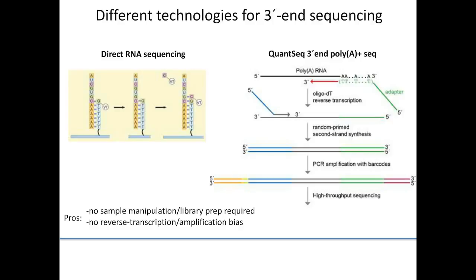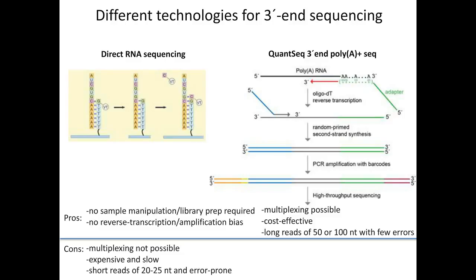If we look at the pros and cons of these, the pros of the direct RNA sequencing are that there are no sample manipulation or library prep involved, and there's no reverse transcription or amplification bias. However, the pros for the QuantSeq method are that it's incredibly cost-effective in comparison, and multiplexing is possible. Because it's utilizing the Illumina sequencing platform, long reads of 50 or even 100 nucleotides are possible, and there are few errors in comparison. And the cons of the direct RNA sequencing is that multiplexing is not possible.